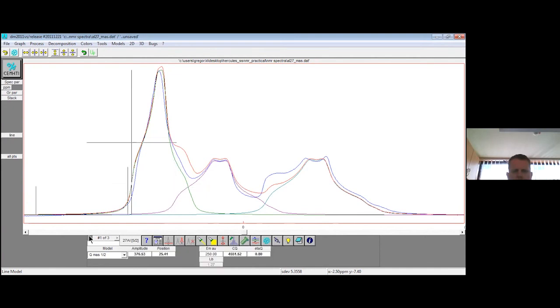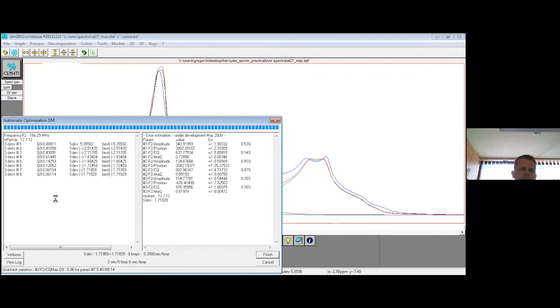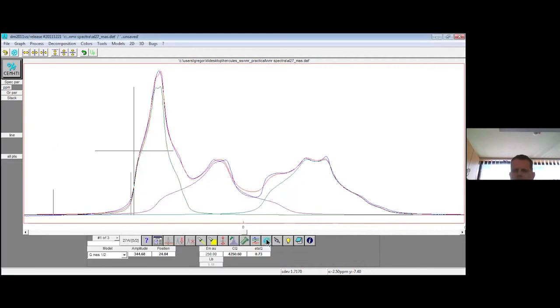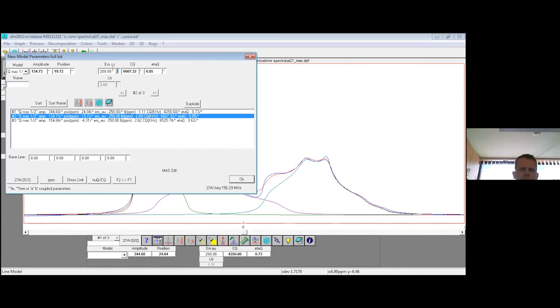Okay, now I guess I've let all these parameters vary, and I will start fitting, and something happened. Let us check. Okay. Yeah, the shape matches better than it did before, but it's probably, let's say, broadening is too large, at least for these peaks over here. So I will also let this broadening vary, and perhaps we'll get an even better agreement between the experiment and the measurement.